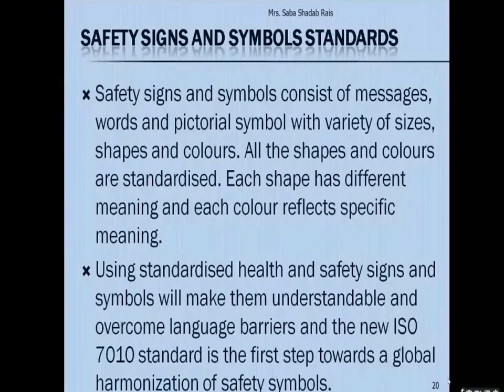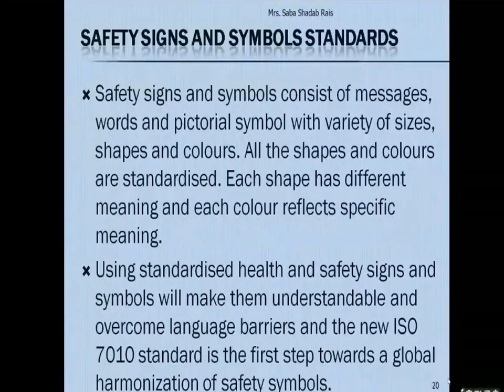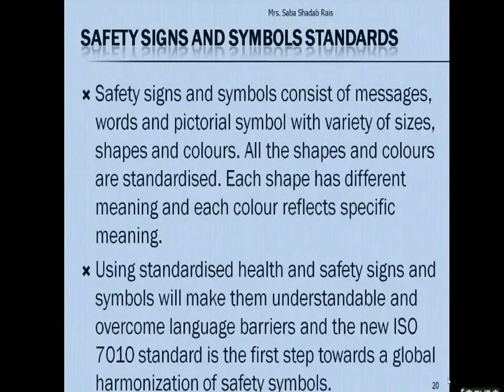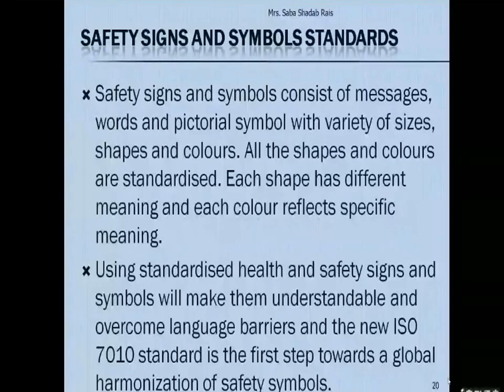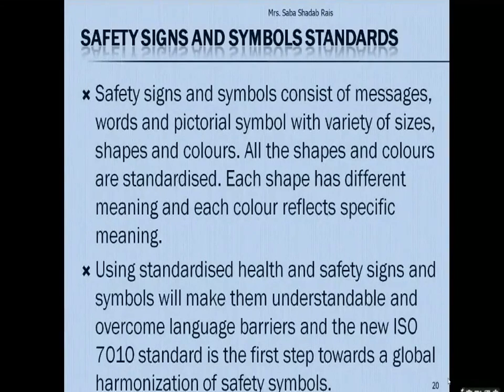When you were small you might have observed that your teacher used to check your books with a red pen to mark your mistakes. So the red color circle indicates something is wrong. This shows that all shapes and colors are standardized — each shape has a different meaning and each color reflects a specific meaning.